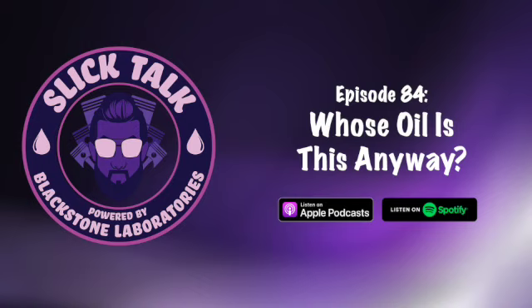Boron, calcium, phosphorus. If these additives are either in an unusual balance, if we see levels that are way out of whack with what we should be seeing, we know how these elements should be, in the sense of, boron, what is that level in relation to phosphorus, calcium, and so on. We know what to expect from these additives. And if we see an improper balance, levels that are unusually high or low, that can speak to contamination.